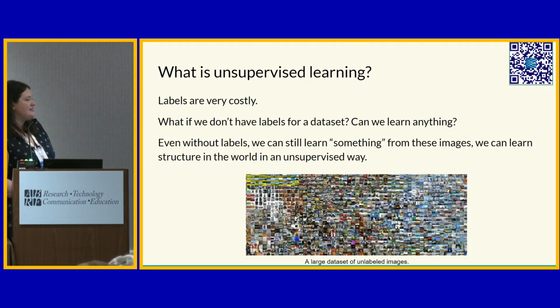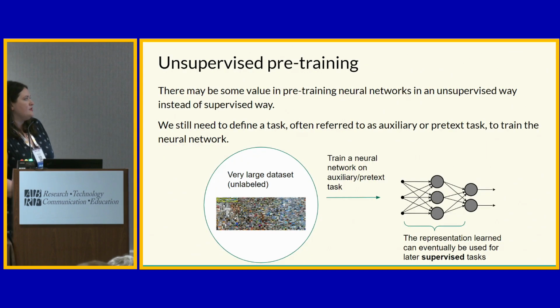Essentially, the idea with unsupervised learning is how can we trick some right answers into the network without it realizing that we didn't actually annotate it. If we do that, we can often get the network to a mostly right state, where then just a little bit of actual extra, real, hand-annotated data is enough to get it all the way over to the right place, because we've gotten it mostly right with some tricks.